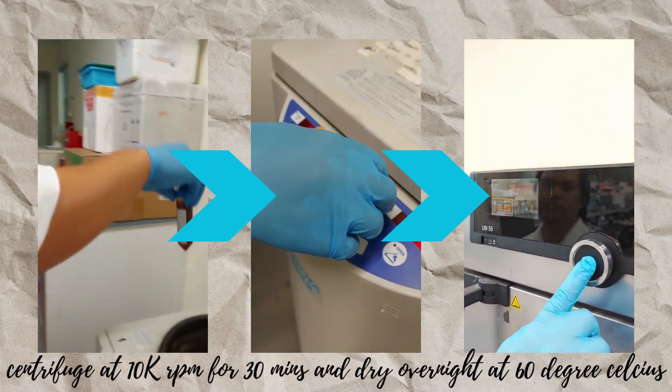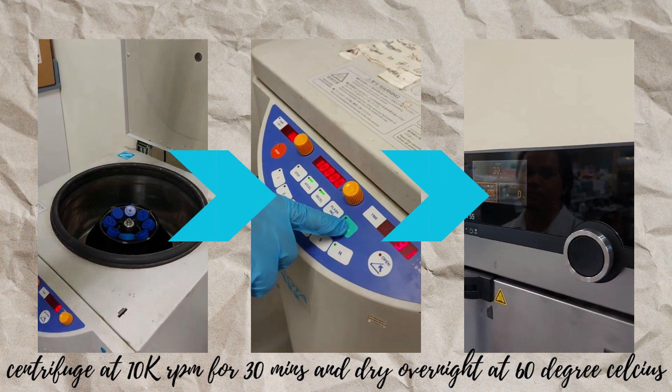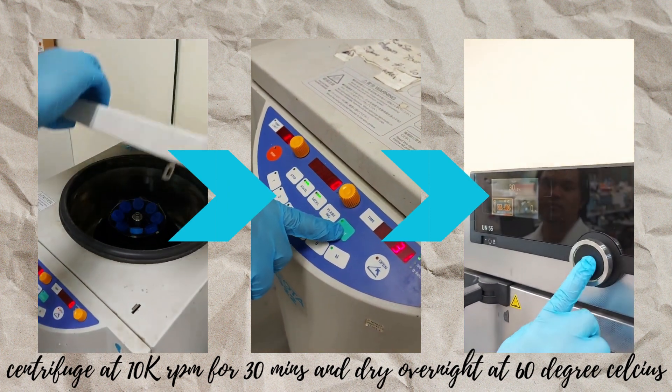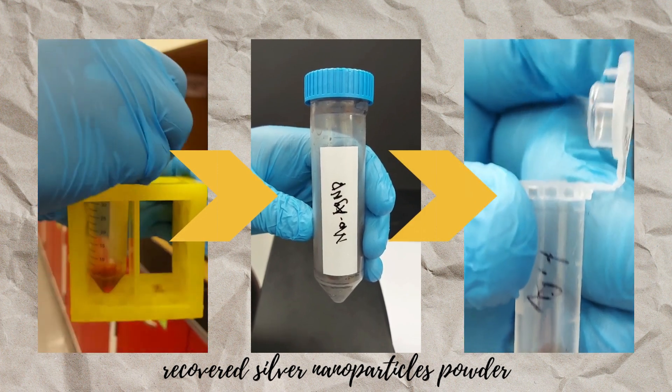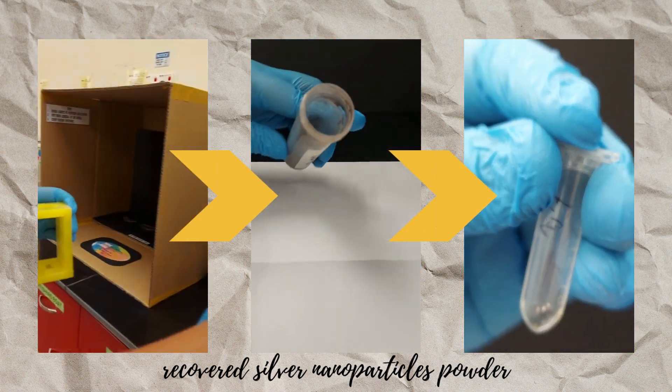Centrifuge the colloids at 10,000 rpm for 30 minutes. Later, discard the supernatant and keep the pellet. Wash the pellets with water if necessary. Finally, dry the pellet in an oven overnight at 60 degrees celsius.